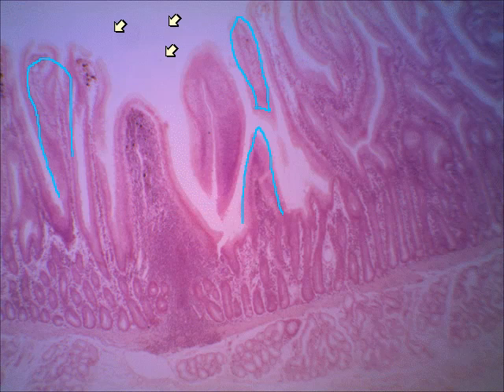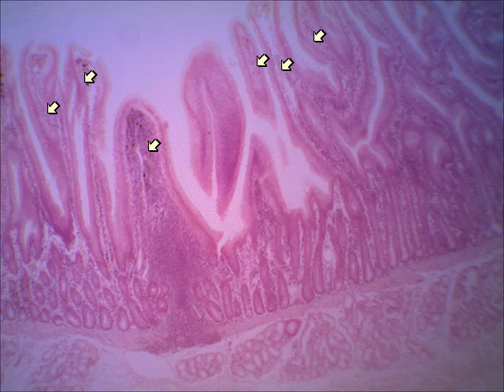And how you recognize a small intestine slide is by the presence of these villi. So make sure, you know, this is a villus, this is a villus, this is a villus. Here's just a section of one. There's a villus, there's a villus. The entire mucosa runs from the tip of the villus all the way down to that point.